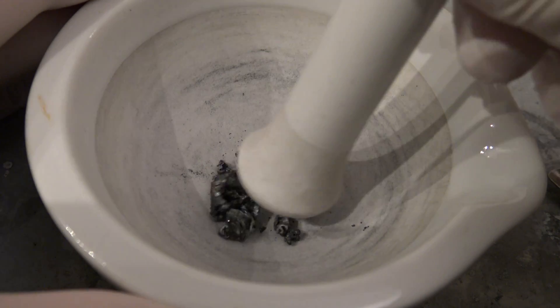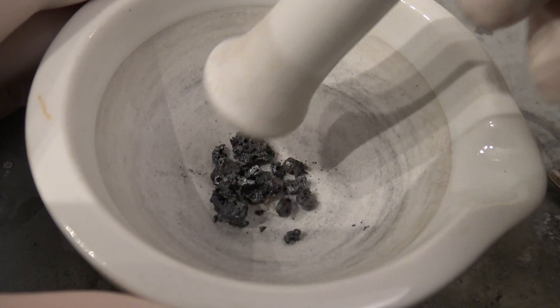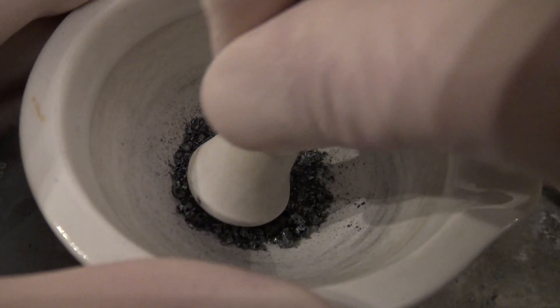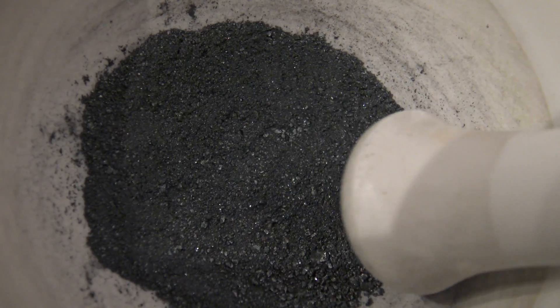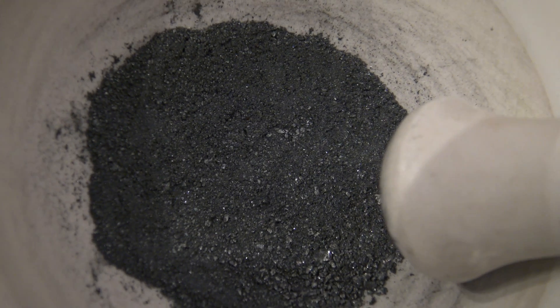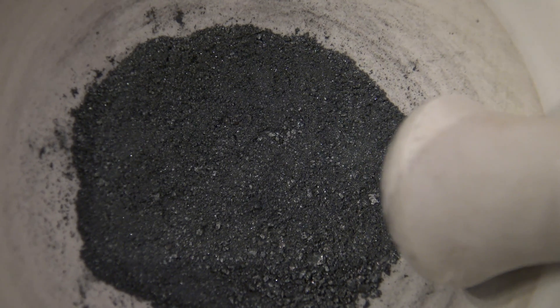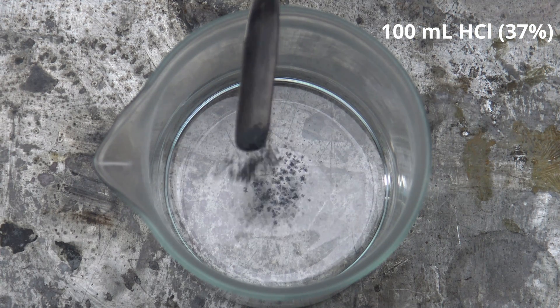After that, it was crushed with a mortar and pestle to increase the surface area, making it easier to react in the next step. Then the product was added to 100 ml of concentrated hydrochloric acid.